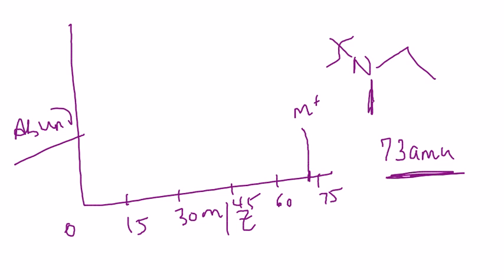You can still use it to determine your overall structure. So again, odd electron molecular ions, if they generate odd electron ions, they may fragment either to odd or even electron ions, but even electron ions will only give other even electron ions from the perspective of mass spec.